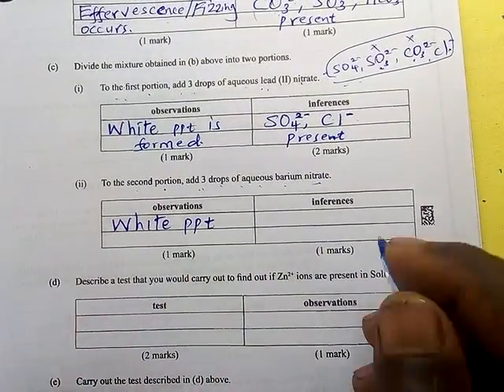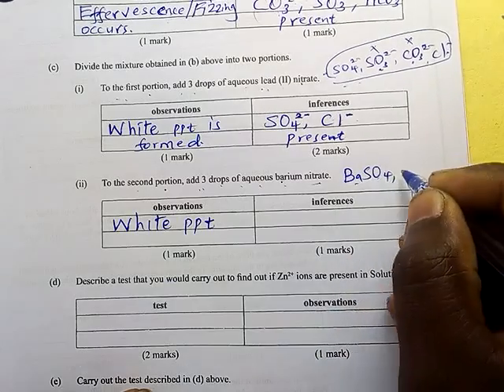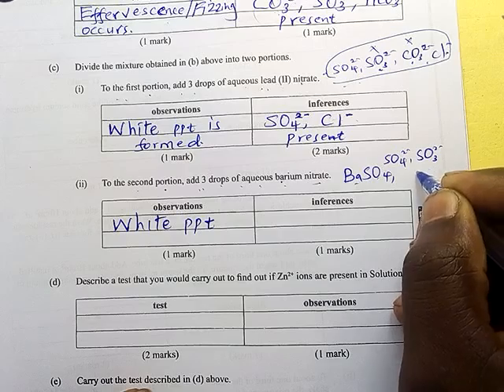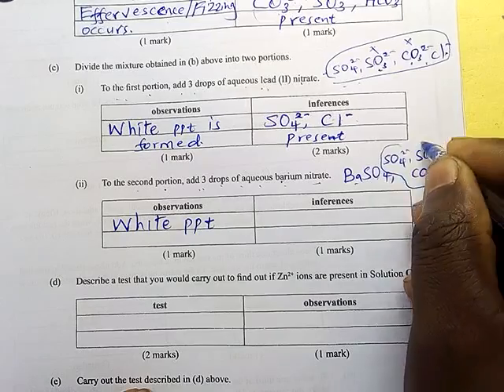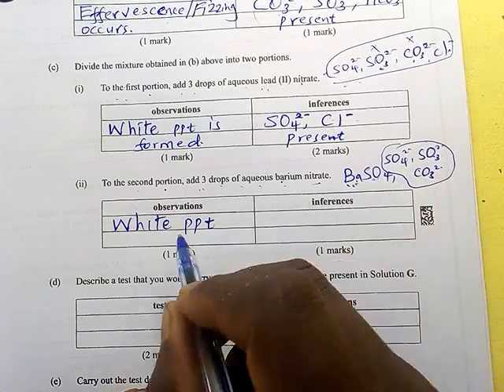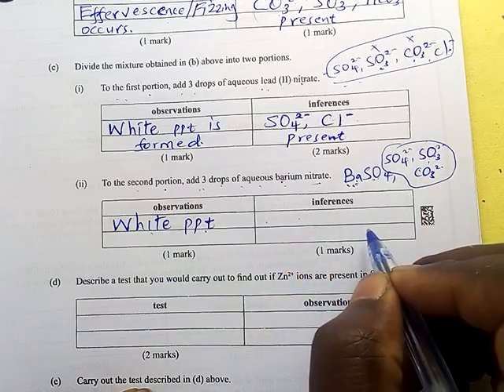Now, let me take you back a little bit. Barium forms a white precipitate with sulfate. Barium sulfate is a white precipitate, and it forms with the sulfate, the sulfite, and the carbonate. So these 3 anions form a white precipitate with barium: barium sulfate, barium sulfite, and barium carbonate. A white precipitate has formed, so we are supposed to include here sulfate, sulfite, and the carbonate present, right?